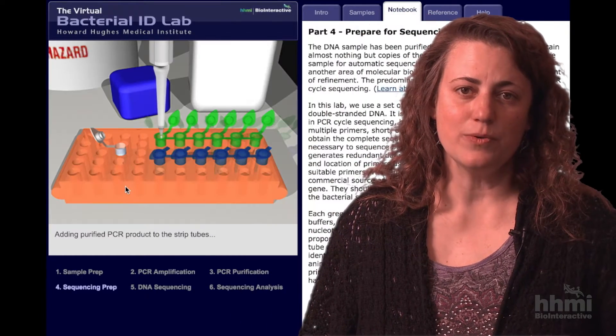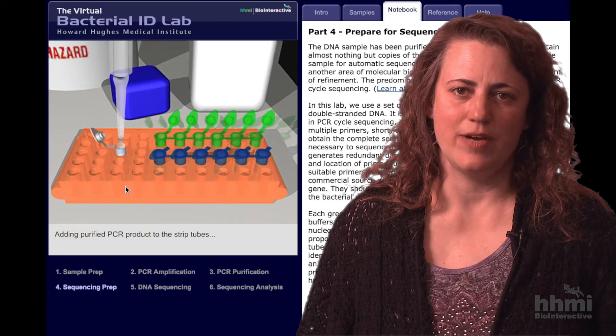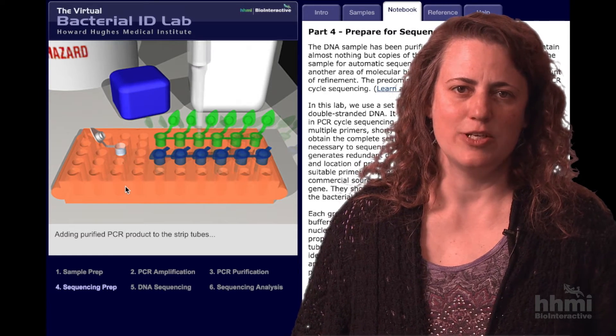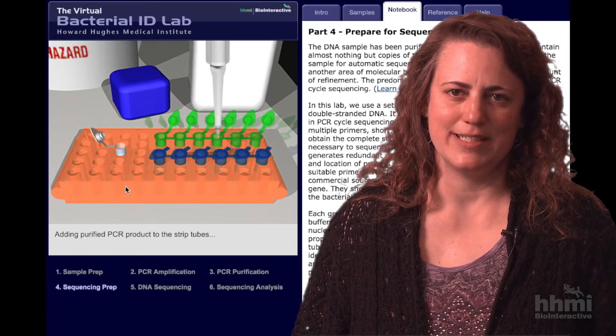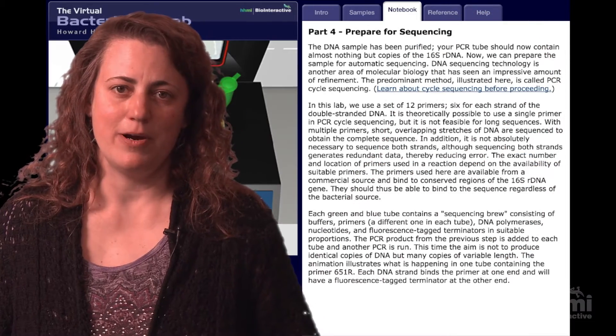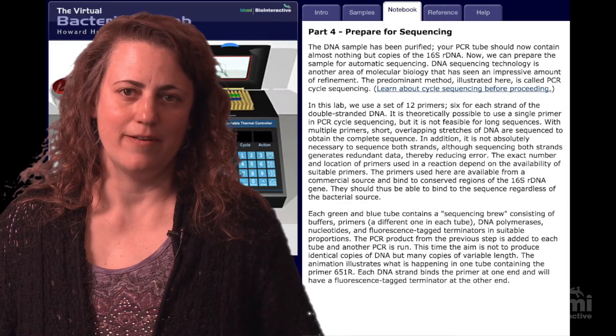The Virtual Lab has a split-screen interface. The left part of the screen shows the virtual laboratory environment, and the right part of the screen describes the protocol.